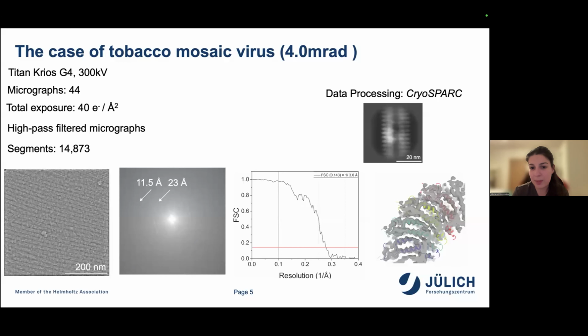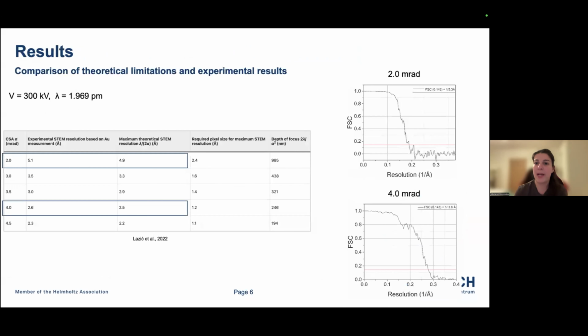But why should you keep these resolutions in mind? As mentioned previously, the opening of the probe, the convergent semi-angle, defines the maximum theoretical resolution that can be reached. So you can see that at 2 millirad, the maximal theoretical resolution is 4.9 angstrom, and at 4 millirad, 2.5. And with this small amount of particles, we have proven that we are able to reach near atomic resolutions, but also to be really close to the maximal theoretical resolution.